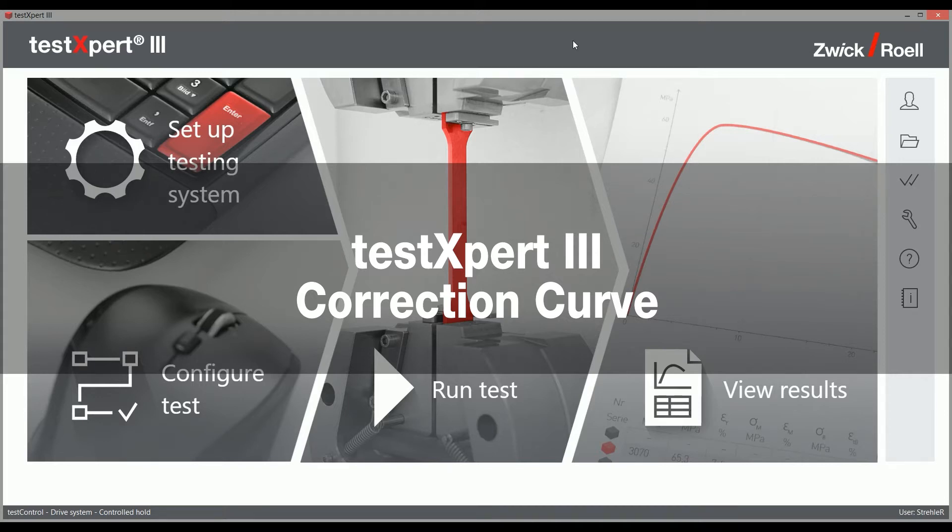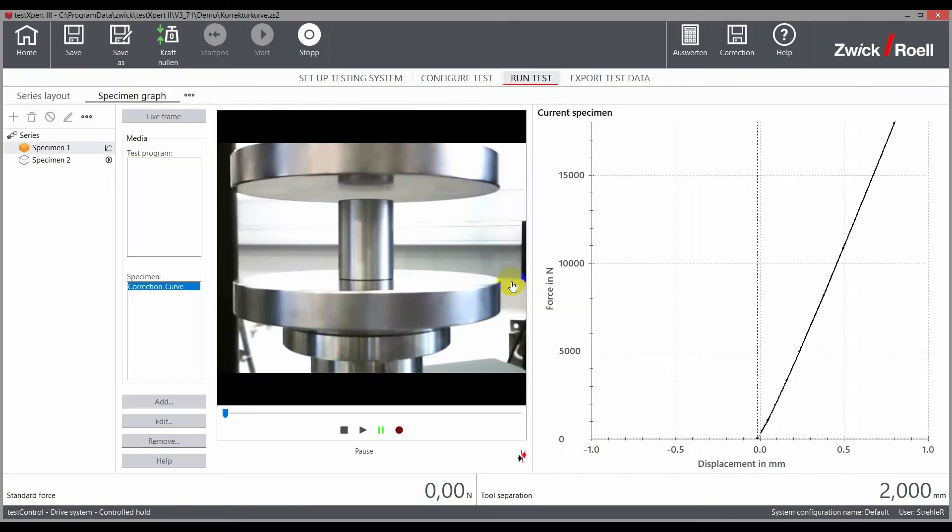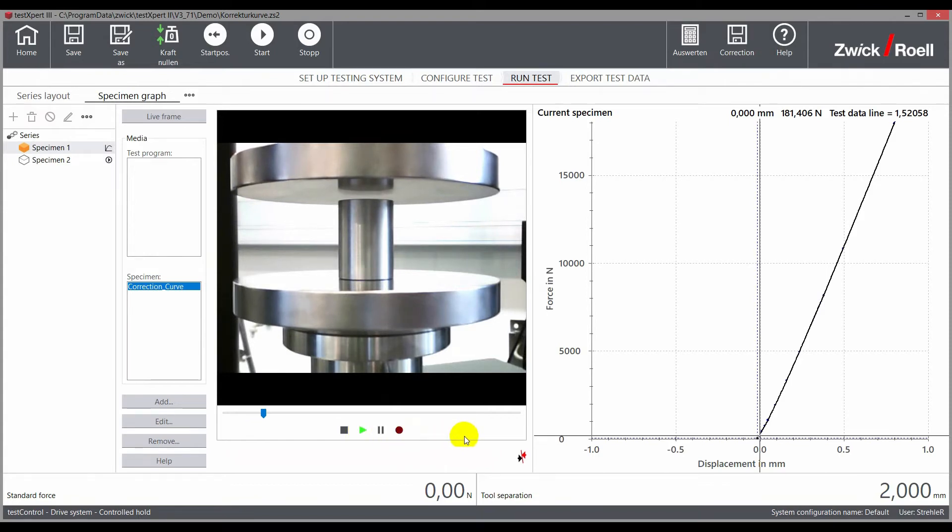For the performance of component testing without additional measuring transducers, TestExpert 3 can refer to a correction curve. The deformation of the entire test arrangement is measured using a specimen that is very stiff in comparison to the actual component.